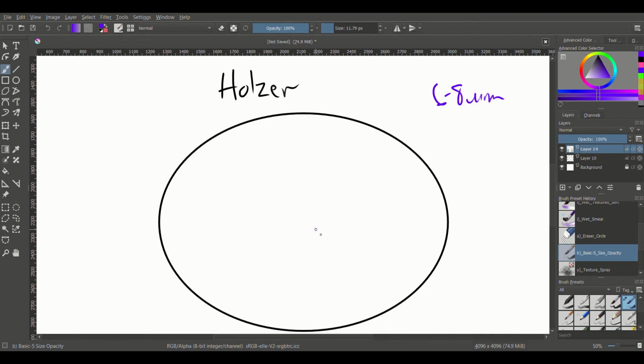And we're going to replace our stain with 10% potassium bromide. And as far as I can tell, this is going to halt our stain at that point. So you're just going to have a whole lot of blue on this slide at this point, and then we're going to let it blot dry. So we've stopped the reaction, but we're not done because everything's blue. We can't tell what's what. Once everything is actually dry, then we're going to differentiate.